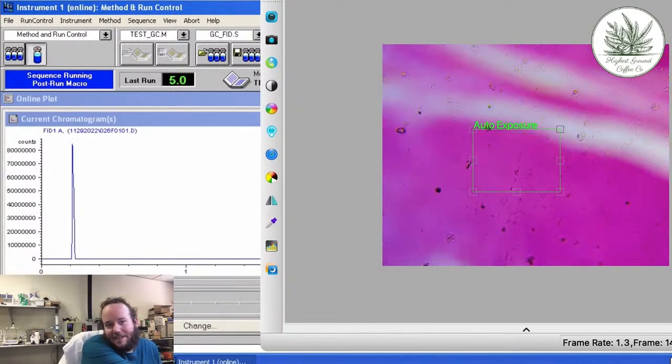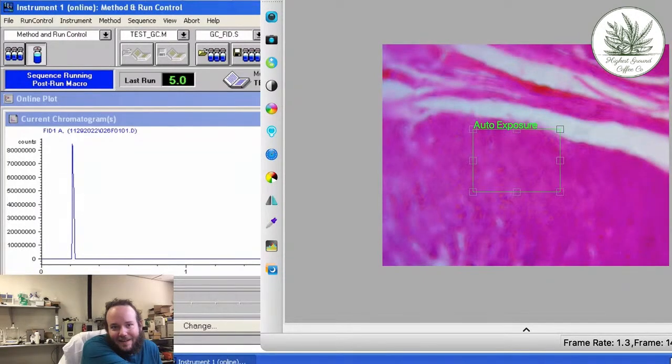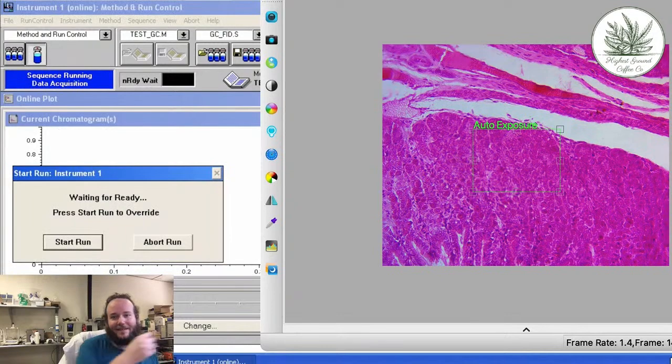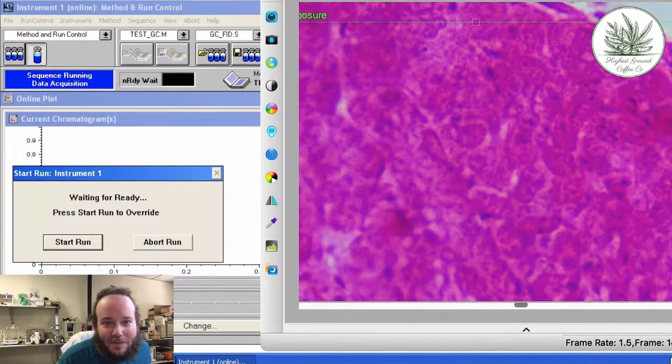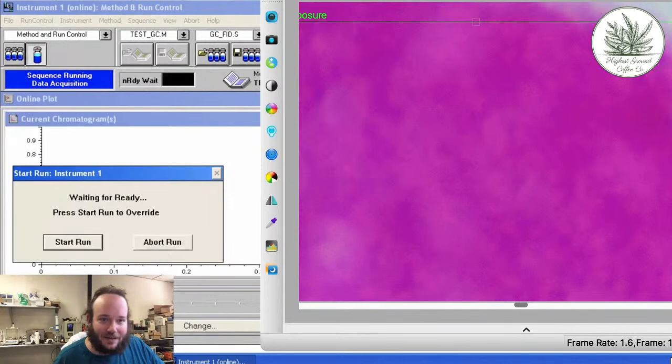So this is the dust on the top layer. Then we focus past the dust. Check that out. I'm going to magnify this to 50%. I'll see if we can get it any clearer. Not that direction.